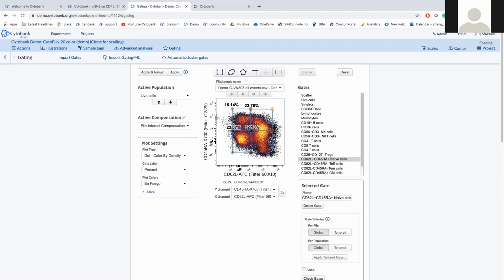So we do have a question that asks which types of files can I upload? Can I upload only FCS files? When we talk about the job feature, you will be able to upload any CSV file and convert it to FCS format in Cytobank. So it's very universal. We can deal with a lot of data types other than FCS files.